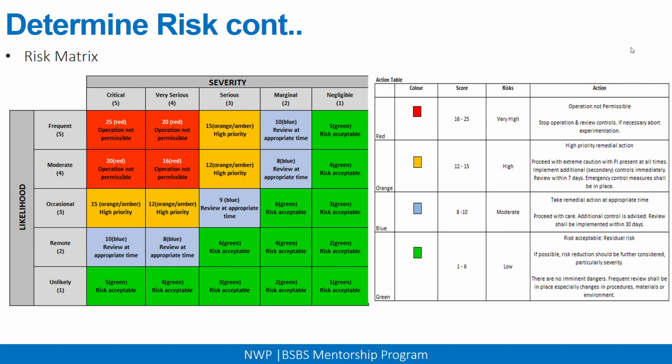On the left in the picture is the risk matrix that I introduced earlier on during the session. The risk matrix will tell you the possible ratings for your likelihood and your severity, and therefore it also gives you outputs for your combinations of likelihood and severity, so that you know where exactly your risk will fall.